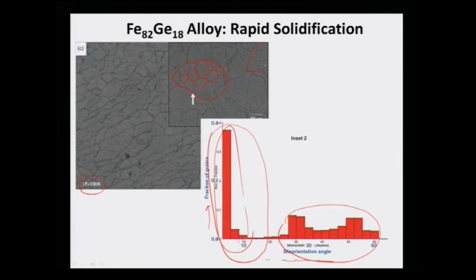So, that means there is a distinct change in the nature of the grain boundaries as the undercooling increases. As we know, undercooling increasing means the driving force for solidification increases, so there will be more stress generation, and the chances of recrystallization are more. So, it looks like these grains which are formed here may be due to recrystallization, which will become clearer as I go on.